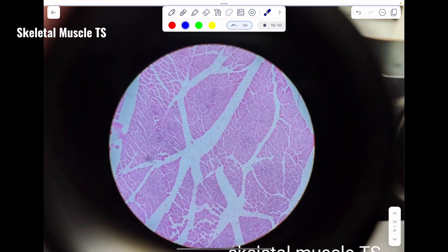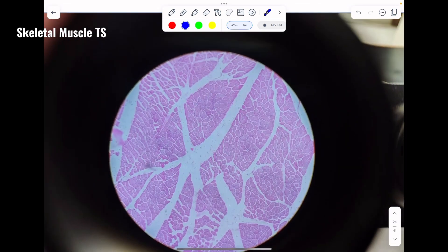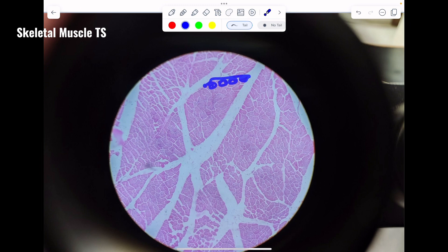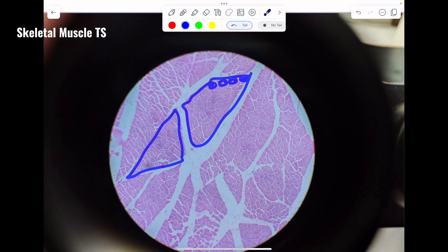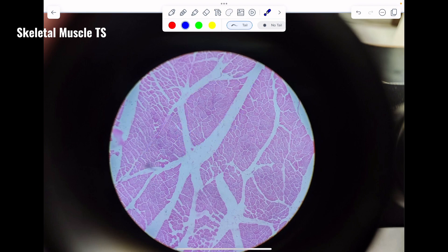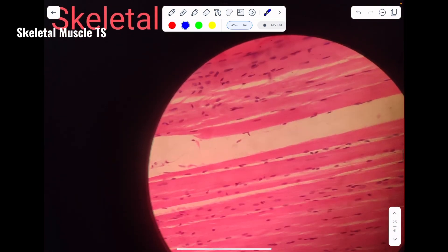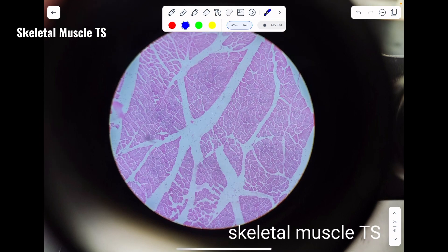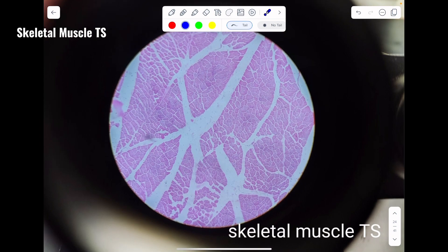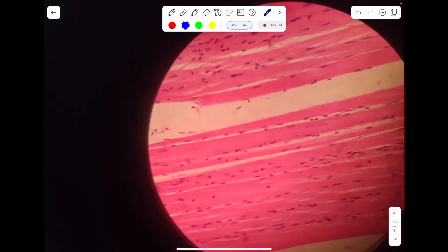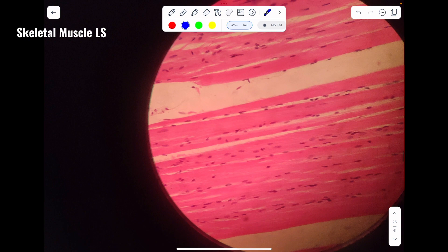Here you can see muscle fibers that are arranged in a bundle called fascicle, and each fascicle is well separated from one another with the help of perimysium. So this is skeletal muscle — specifically the transverse section.